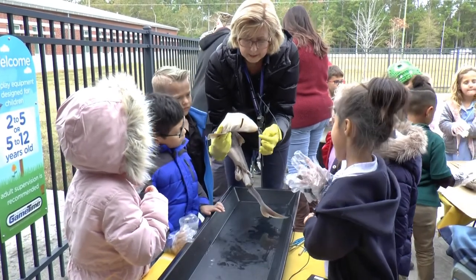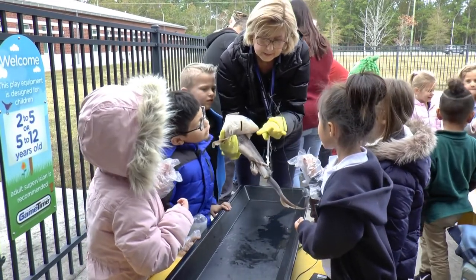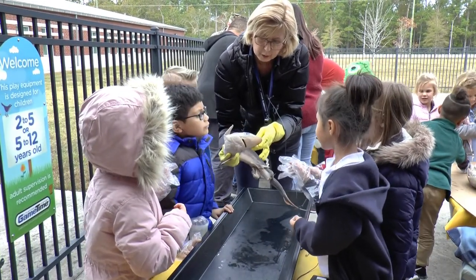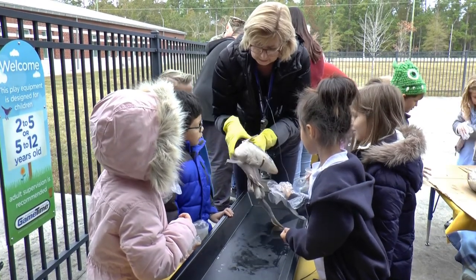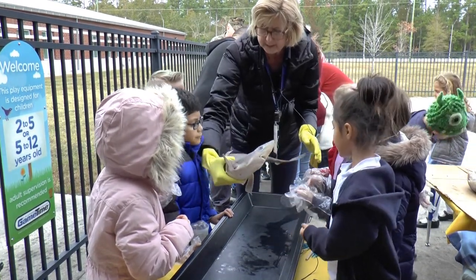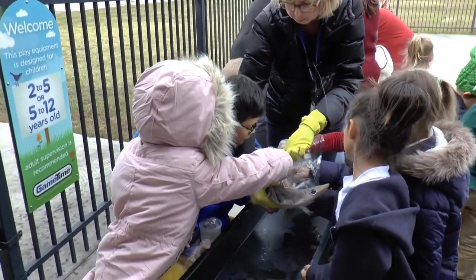Guys, what is this? Mouth. Okay, what is that? The nose. Okay, that's the part. What are these things right here? Gills. Okay, and let's see. Where is the dorsal fin? Dorsal. Remember, the dorsal is the one on top.